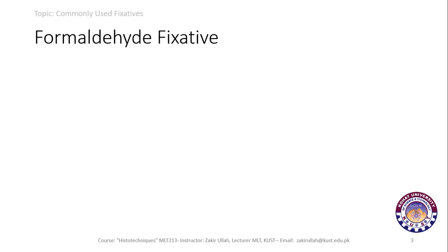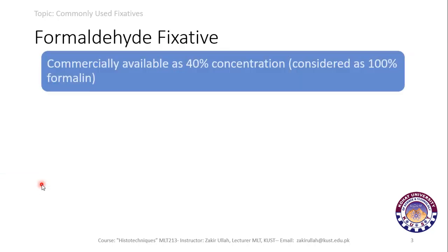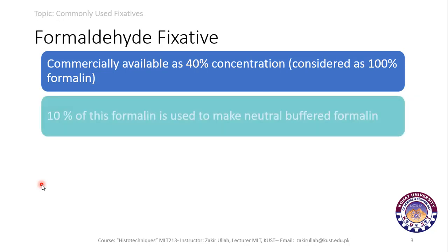The first one is the formaldehyde fixative. This fixative is commercially available at 40% concentration, and this 40% concentration is considered as pure 100% formalin.